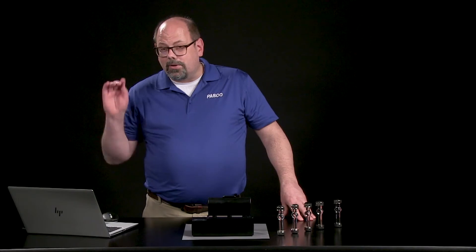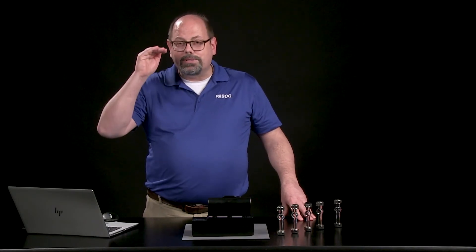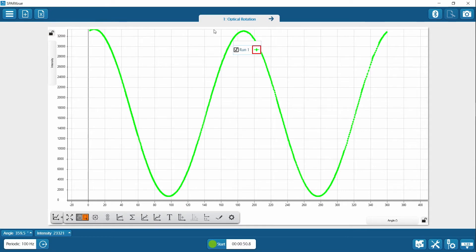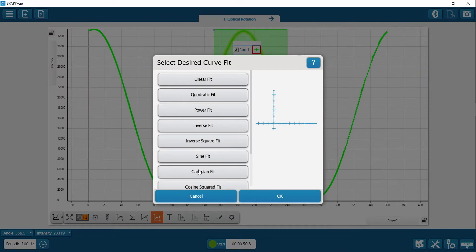I could put the coordinate tool on there and sort of go back and forth until I find out which one's highest. It's more easily found using the line fit tool. I'm going to select a region of this graph, maybe the top third, top half, so you have a good selection of that peak. I'm going to use the curve fit tool, which is either down in the toolbar at the bottom, or if you click on that area of selection and go to the last choice, you would say let's put a Gaussian fit.